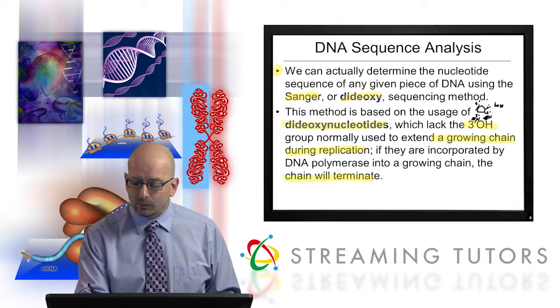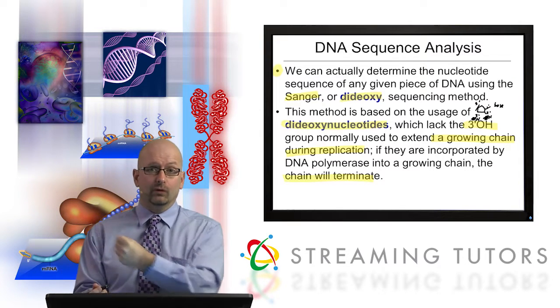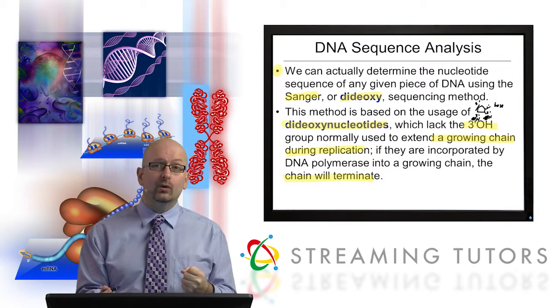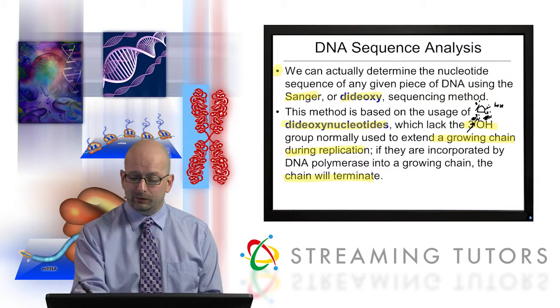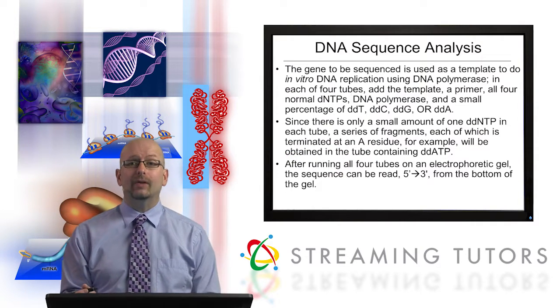If you take that one off, now you've dideoxyed it, right? The first one was taken off to make the DNA, which makes it deoxy. Now you took another one off, and you've got a dideoxy. And no incoming nucleotides can attach to that base. But it's fine up here. It can get incorporated into a chain. So let's check out the brilliance of this.